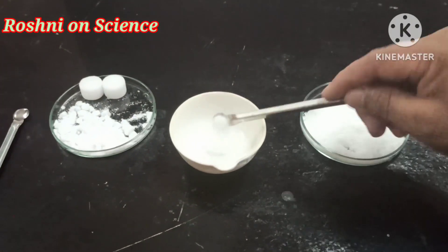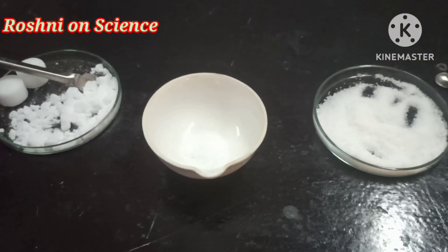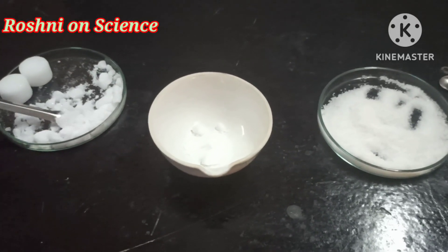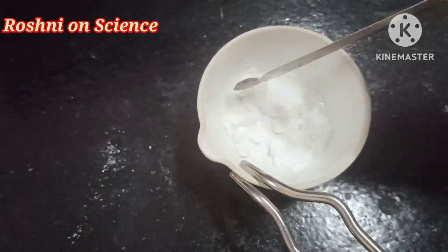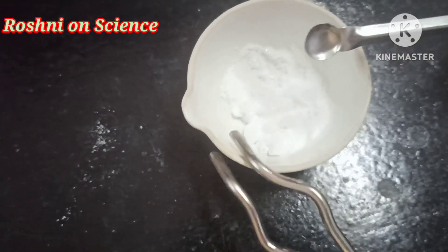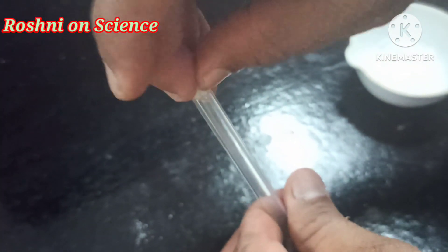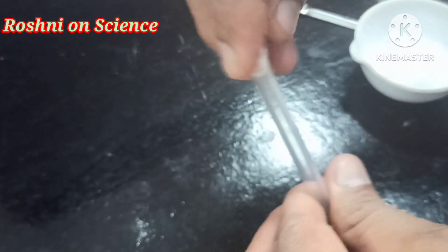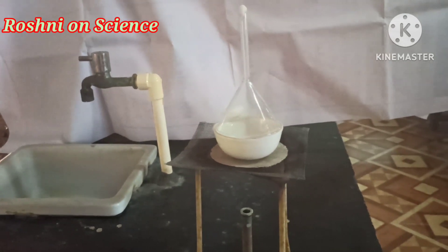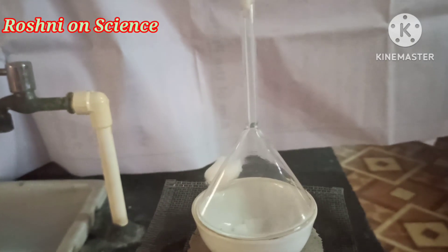Take a mixture of salt and naphthalene in a china dish. Put a cotton plug on the stem of the funnel. Put an inverted funnel over the china dish. Now heat slowly and observe.